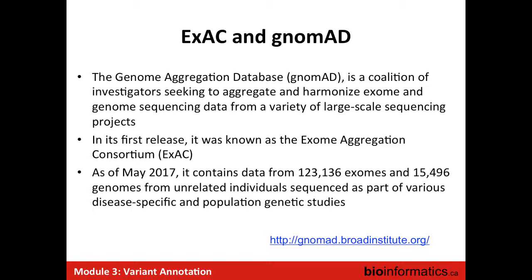That's a good question. If it's a different platform, you might not have a call in that database because it didn't cover that particular region. So you can't really use it for being sure that it's not there, right? But if it's been observed in that database, at least you know that it's been there. It's not fully homogeneous: it's different platforms and different variant calling in some ways. So it's not a fully homogeneous data set, but at least if it has been observed before, you know that. But you can't use it to say it's not been observed.